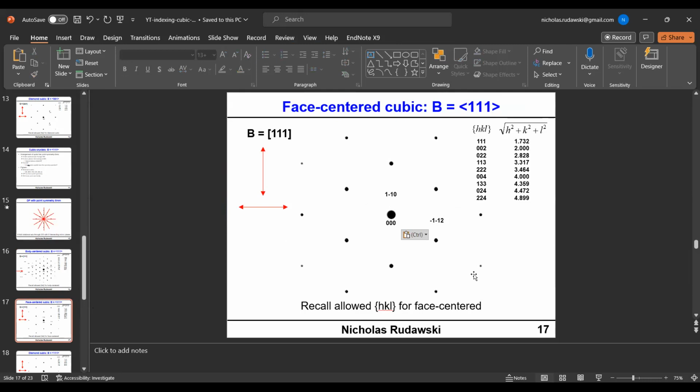Okay, so now, as you can probably guess, I have G1 here and G2 here. I'm going to get the same ratio for R1 to R2. I should, right? The symmetry is the same. The arrangement of the spots is the same, even though they're spaced out wider, but I should get the same answer. But just for the sake of argument, let's go ahead and measure.